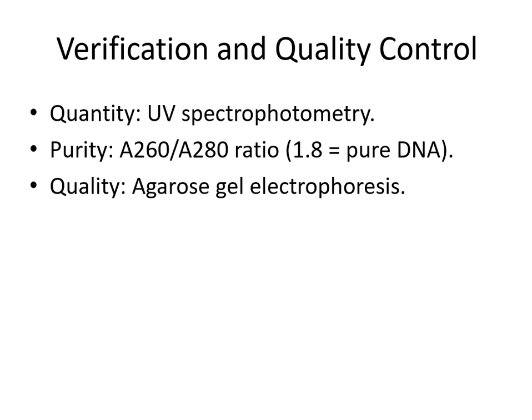If the DNA has a ratio of 1.8, it is considered to be pure DNA. And to test the quality, agarose gel electrophoresis plays a vital role.